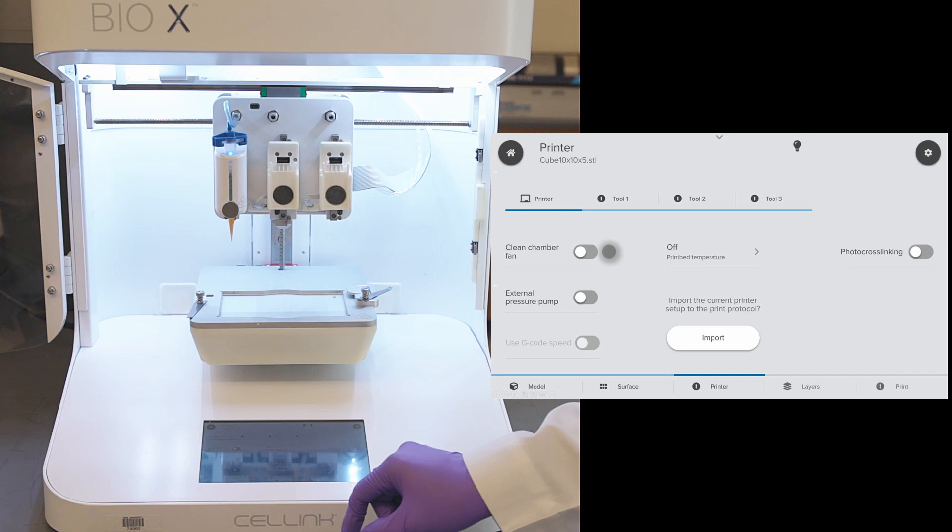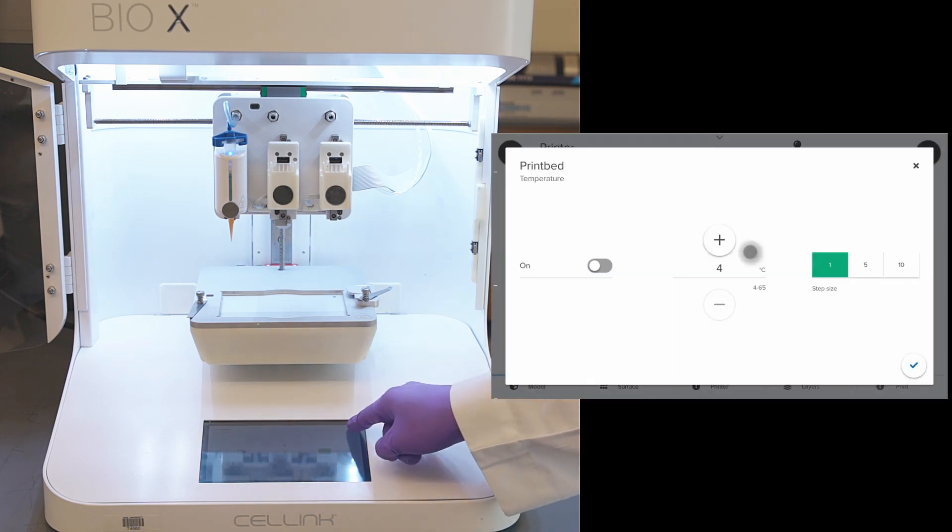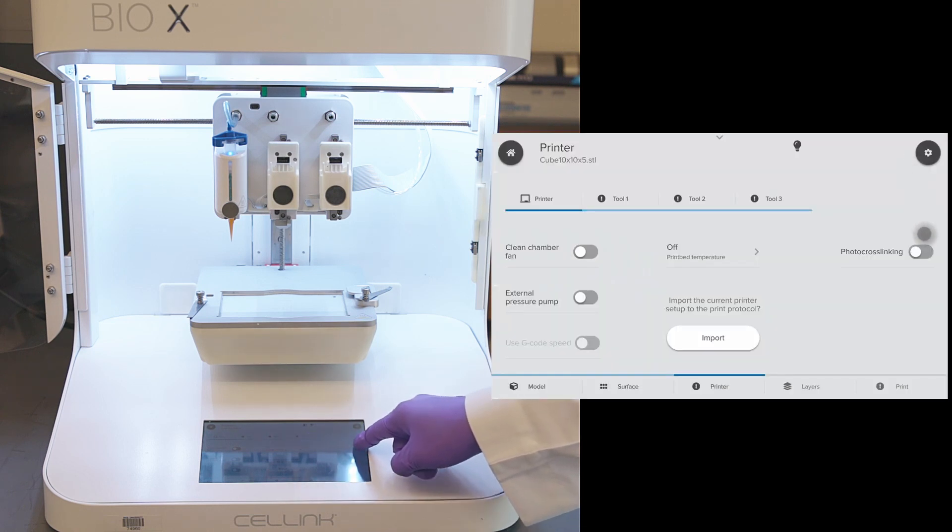Next is the printer. Here, we have the option to clean the chamber for sterile 3D printing, or if we are using an external pump to provide air pressure, option to heat or cool the print bed, and also for photo crosslinking. If you want to enable, you can choose the frequency and the position where the crosslinking happens. Today, we will not be needing any photo crosslinking. We have a UV photo crosslinking printhead for 405 nanometers if needed.